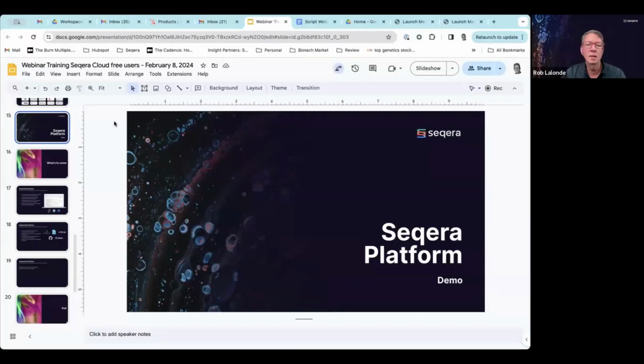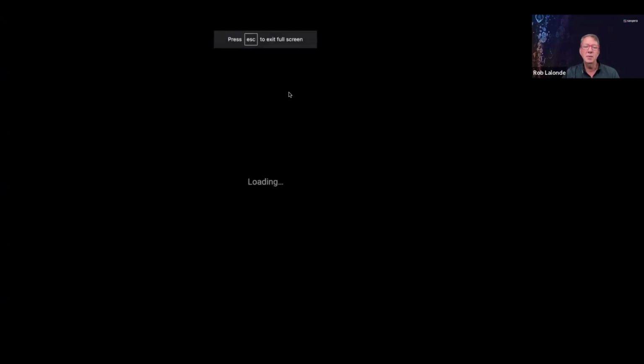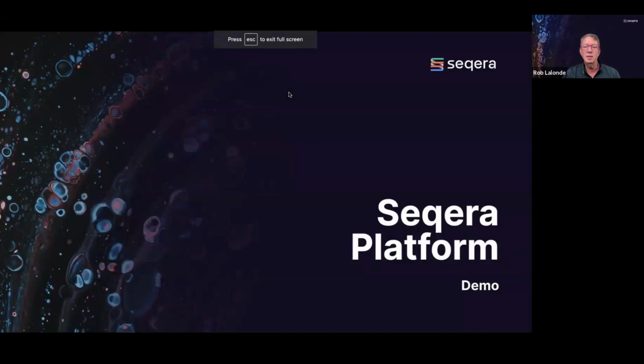Awesome. Thanks, Isha. I'm just going to share my screen again. And I think you are first up. In any case, we're going to talk about some of the new things. I'm just waiting for my screen to show. Hopefully you can see that now.